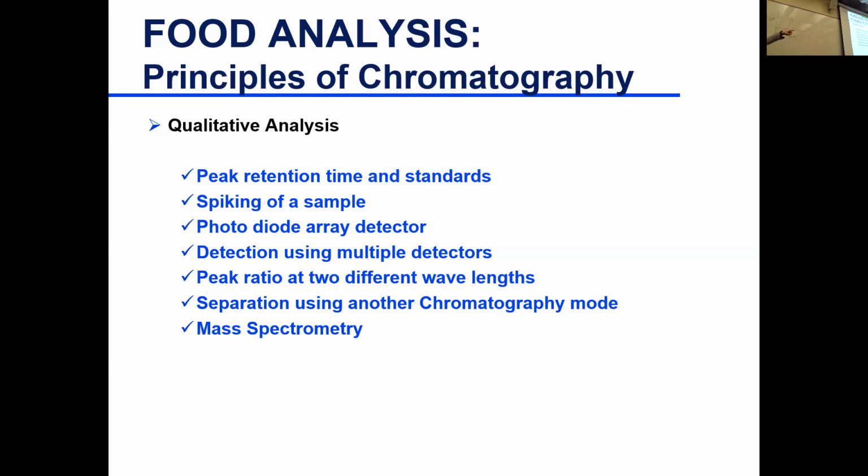But with a photodiode array detector, you see another window here that gives you absorption over lambda or wavelength. Every split of a second, you get an absorption reading at different wavelengths.